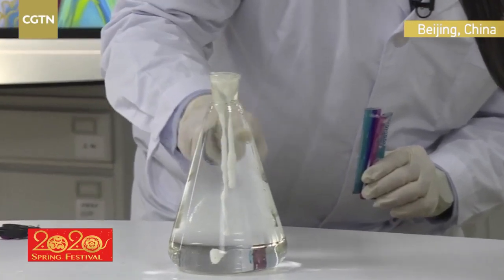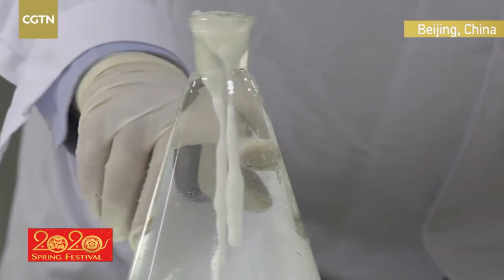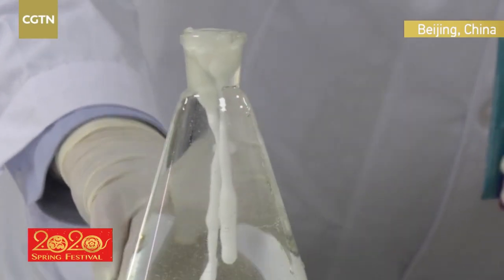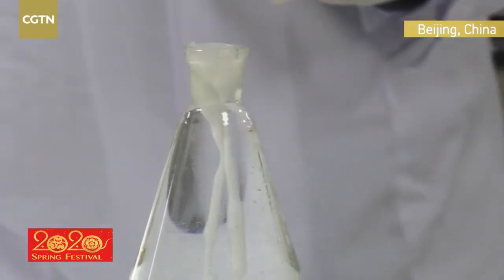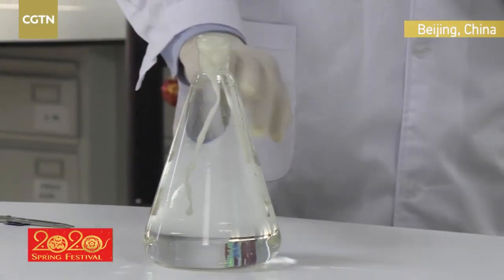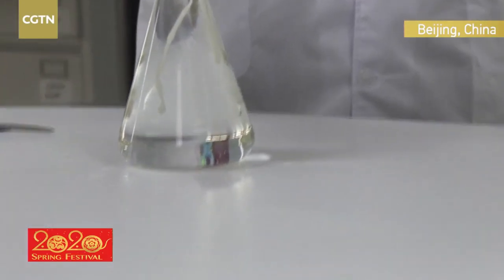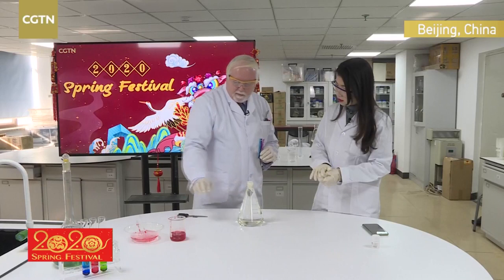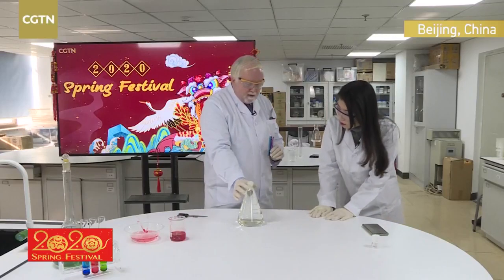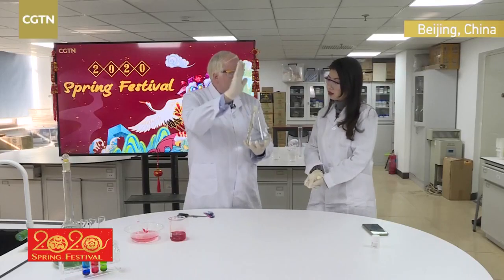Yes. So that's the calcium carbonate, like the simple antacid, reacting with the acid to make carbon dioxide. Then the material sinks initially, and the carbon dioxide lifts it up. But you can see now this gel material that we made here is also being produced. So the calcium carbonate dissolves in the acid, makes the calcium chloride, which is what we had in this bowl, and the calcium chloride and the sodium alginate in the drug make the calcium alginate. It sort of blocks here, right? Exactly. So now you can see what a nice plug, so that the acid doesn't come out of the stomach into the esophagus.